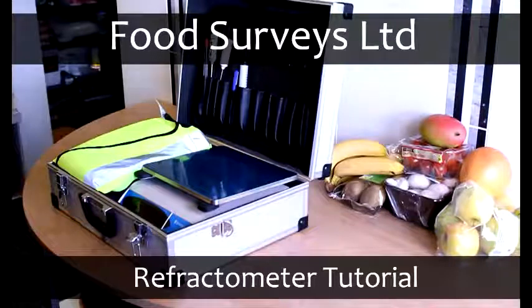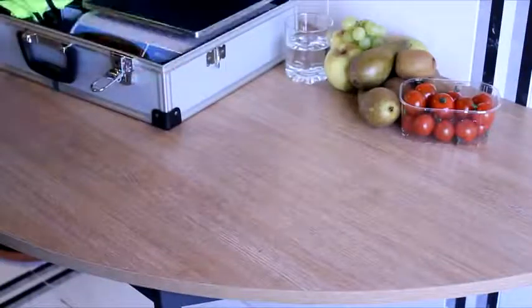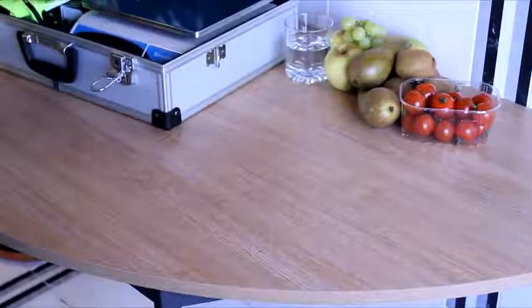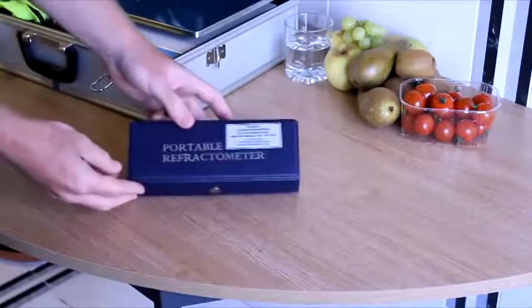Hi, and welcome back to the Food Survey's Food Quality Video Guides. Today we're going to discuss one of the most commonly used pieces of equipment when inspecting food quality, particularly if, like us, you work a lot with fresh produce quality. This is the refractometer.